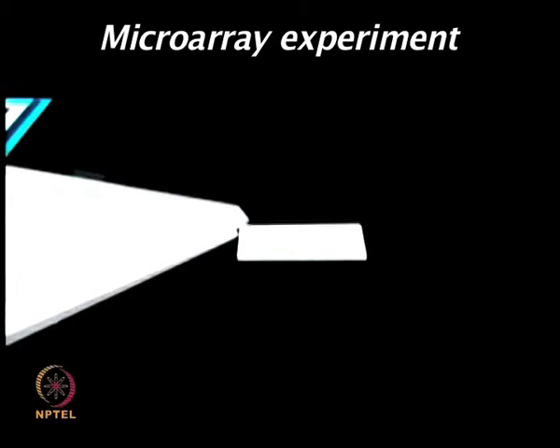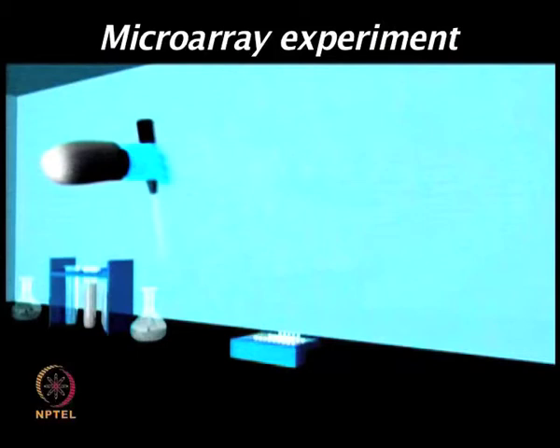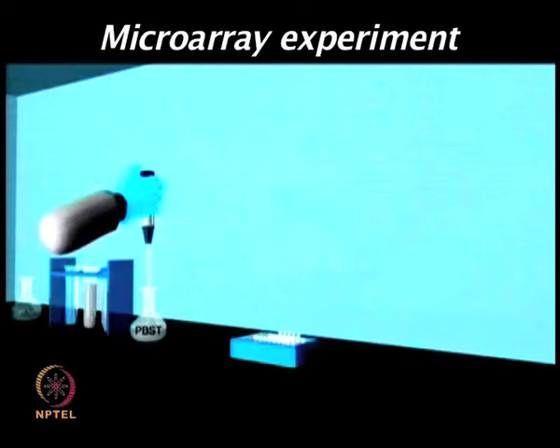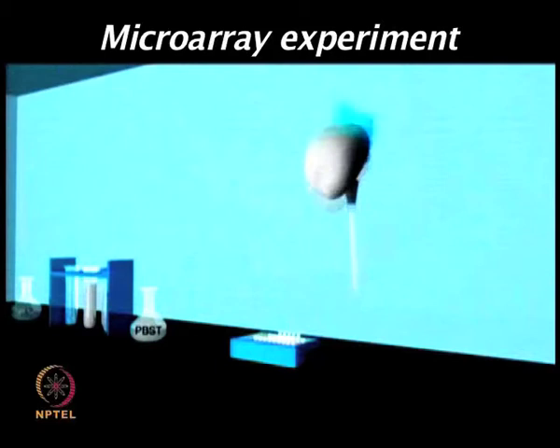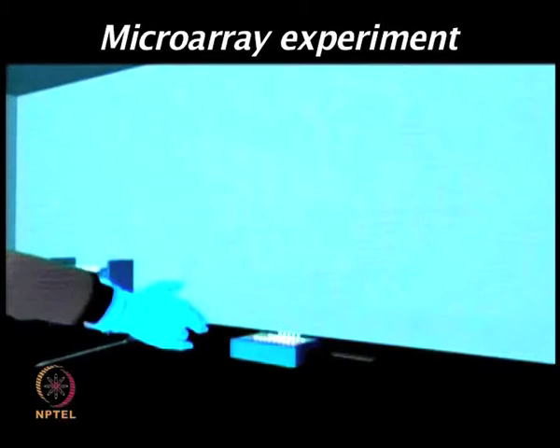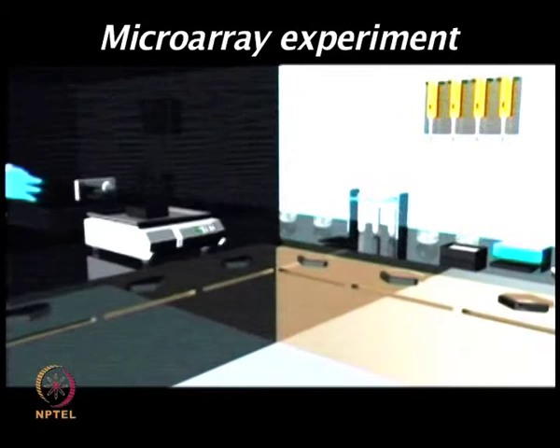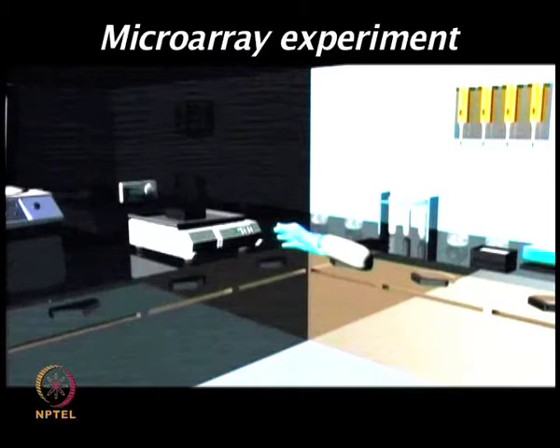And again, different scientists try different types of approaches. Few people prefer using overnight incubation at 4 degrees, and some groups prefer using 1 hour at room temperature. There are different schools of thought here. One is that if you are allowing the serum a long time, it is possible that it is going to give enough time for identifying the right targets. On the other hand, if you are allowing it very long, for example overnight incubation, it is possible that the background will become very high. So people try different types of conditions in the labs, and then they apply serum or primary antibody, and adjust the times for the incubation accordingly.